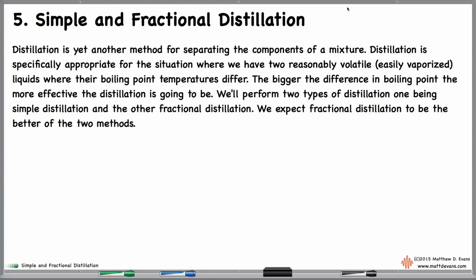So this time we're going to be talking about simple and fractional distillation. So the scenario for using distillation is I've got a mixture of two reasonably volatile liquids. Volatile means that they're easily vaporized. I apply a little bit of heat and they go into the gas form.